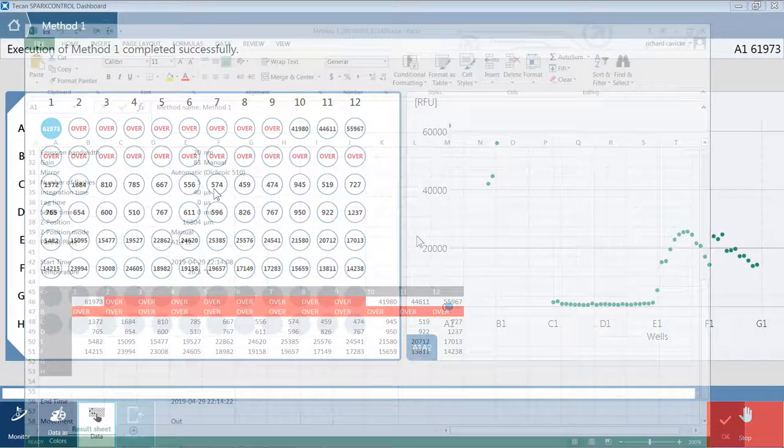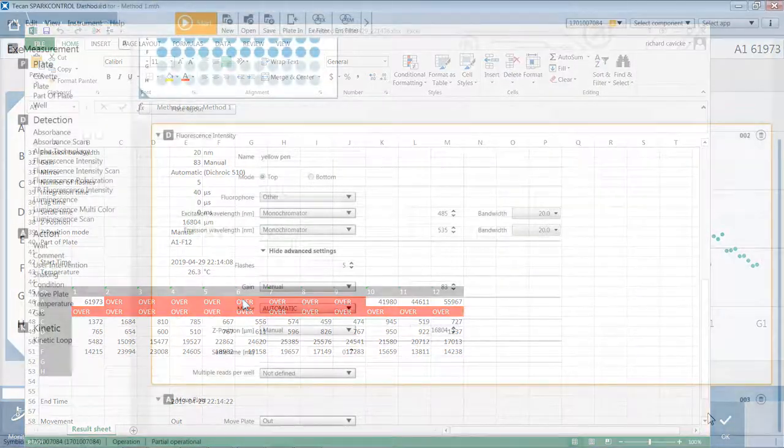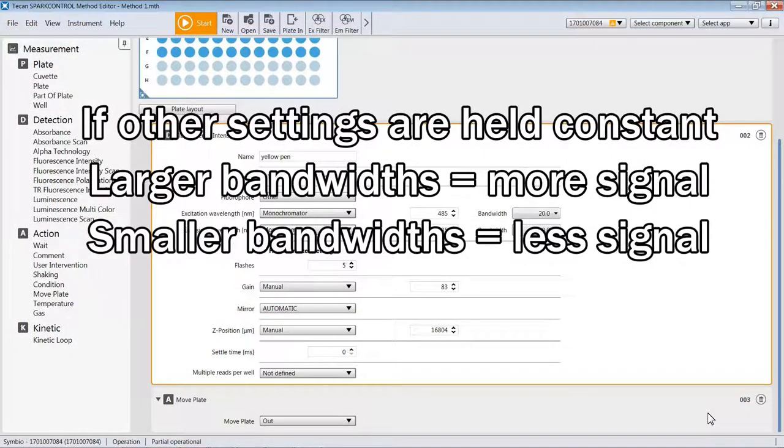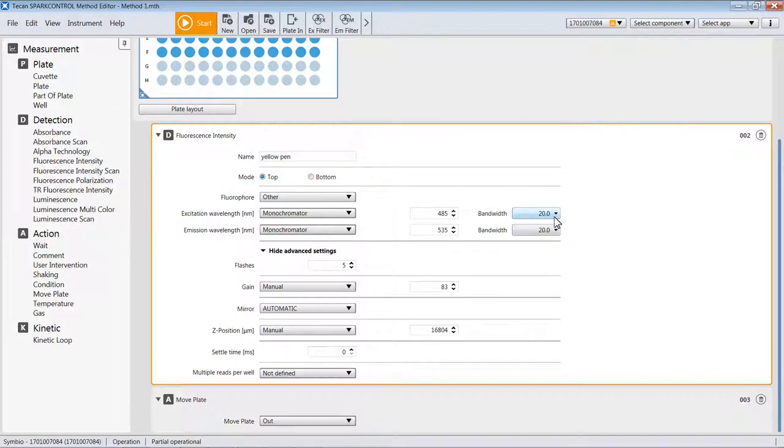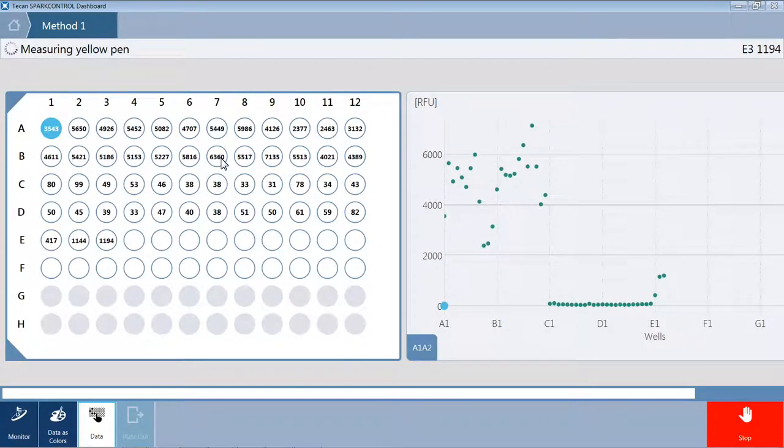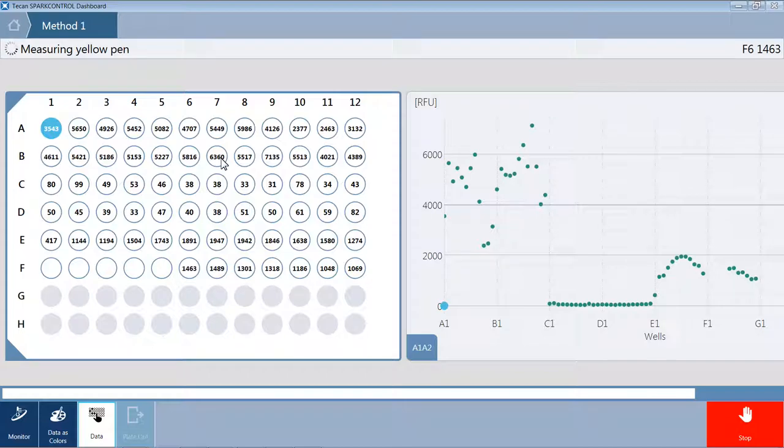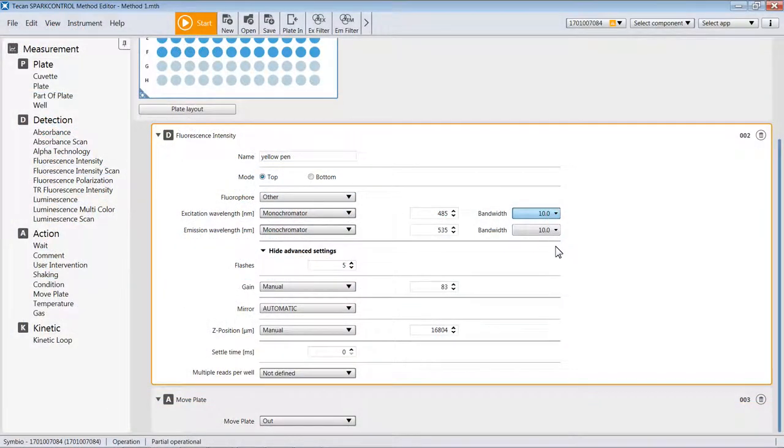Another strategy for changing the intensities of your samples while holding other things like the gain or wavelengths the same would be to alter the bandwidth. Increasing bandwidth distance makes more light and more signal, and decreasing the bandwidth would decrease the signal. In this example, I'll go ahead and change both bandwidths to 10. So we should see less signal. Comparing this data to the previous data, you can see that the signals are now considerably smaller.